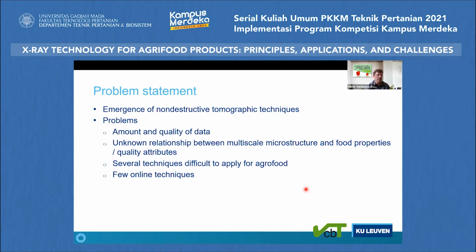You can imagine that if you want to make three-dimensional images instead of just microscopy slices, you're going to generate a lot of data, and you need to be able to deal with a large amount of data. Bayu can tell you all about how much time it takes to process images like that. It's also about the quality of the data. Just because they measure something in 3 dimensions doesn't mean that it is data of good quality. There can be a lot of noise, a lot of artifacts in the data that you need to be able to deal with.